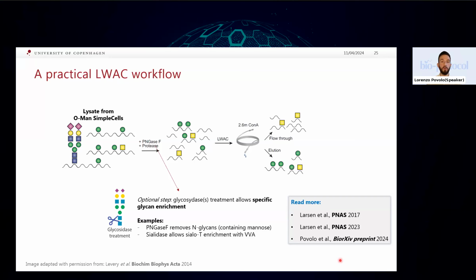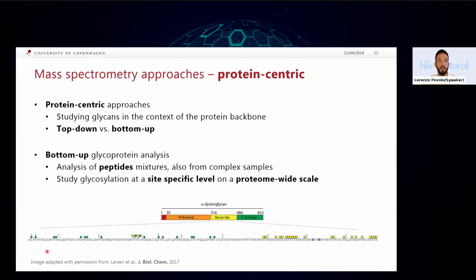So if you're more interested in reporting, for example, what proteins are glycosylated, then you could, for example, show lists of proteins, or the volcano plots if you're doing replicates and quantification. Or if you're interested in specific sites of specific proteins, you could show the old good sequence, which is not really appealing, but it could give you specific and immediate information on what you want to convey.